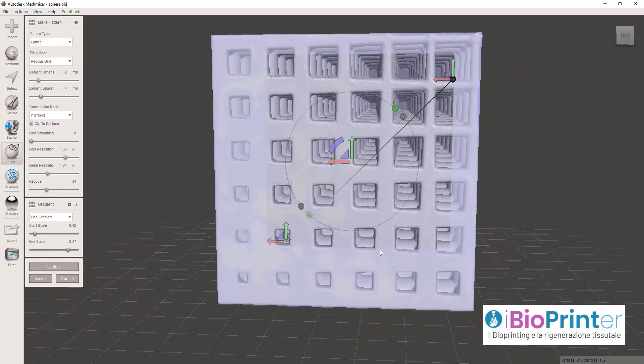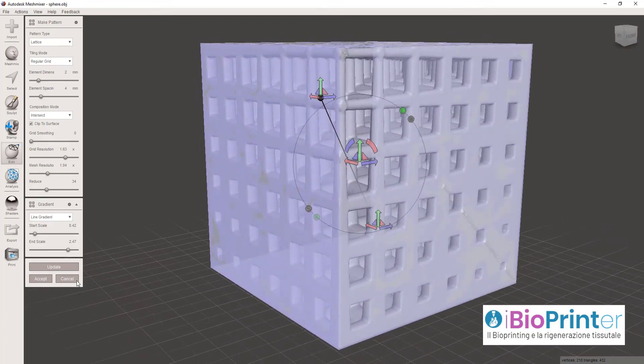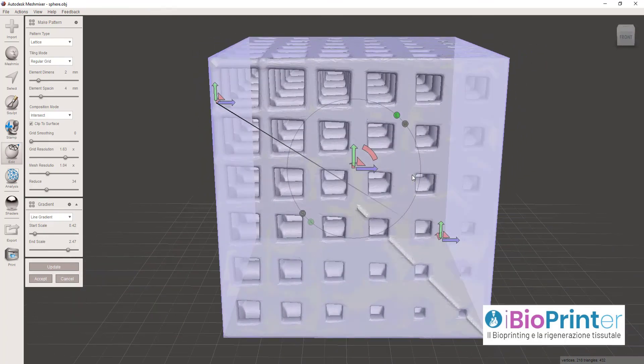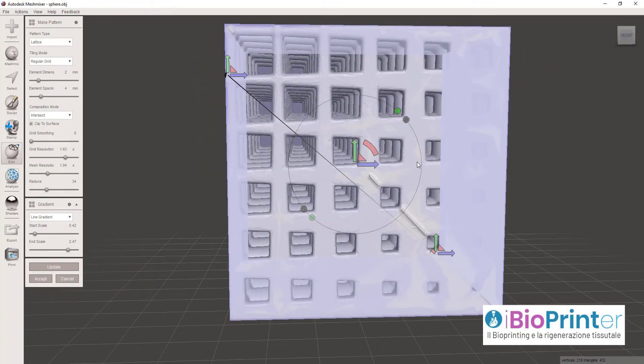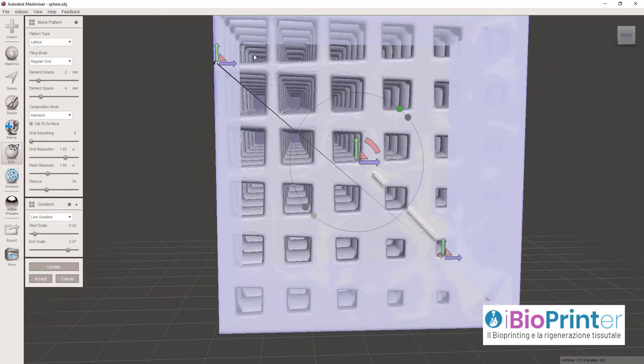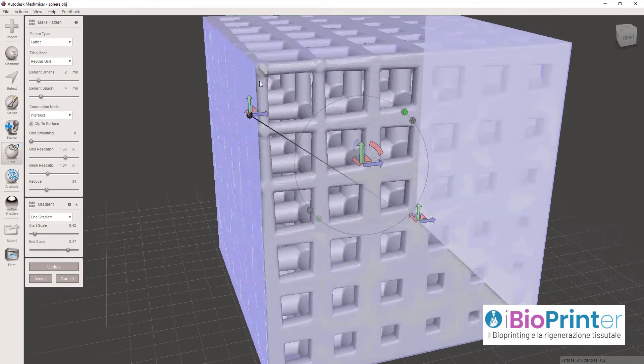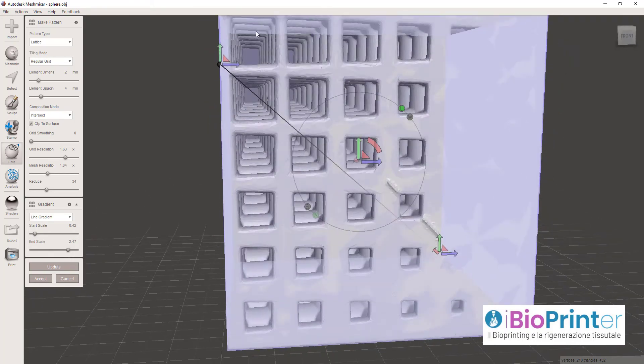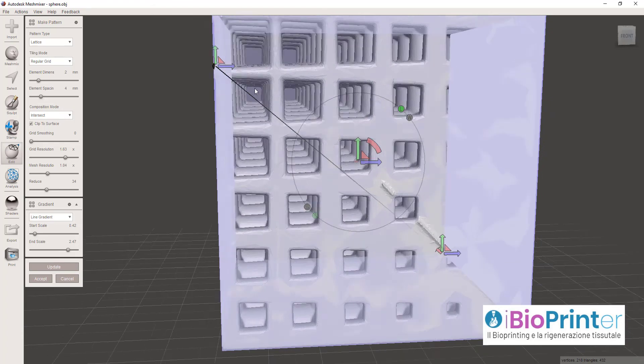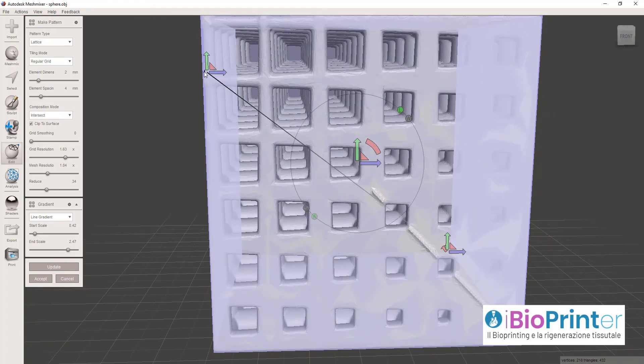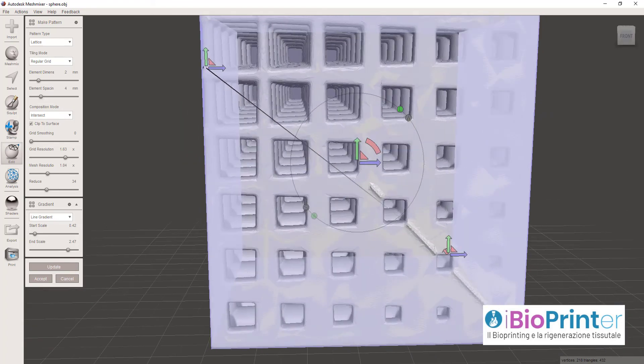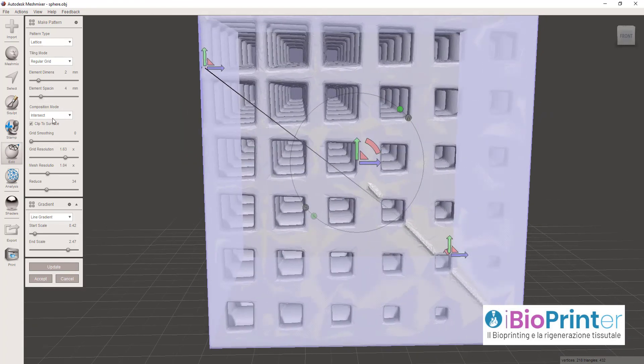Fondamentalmente quello che abbiamo ottenuto è una struttura tridimensionale al cui interno sono scavate delle celle elementari cubiche con dimensione progressivamente decrescente dall'angolo superiore sinistro all'angolo inferiore destro del nostro cubo.